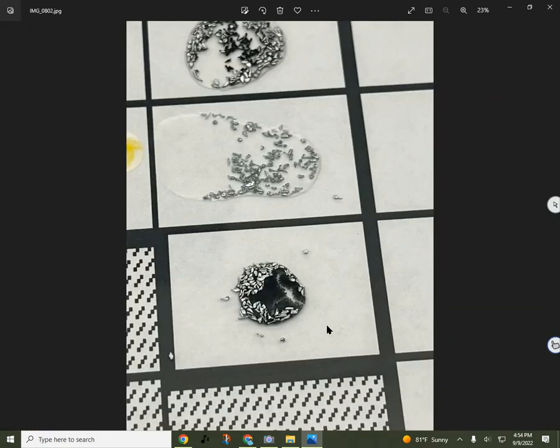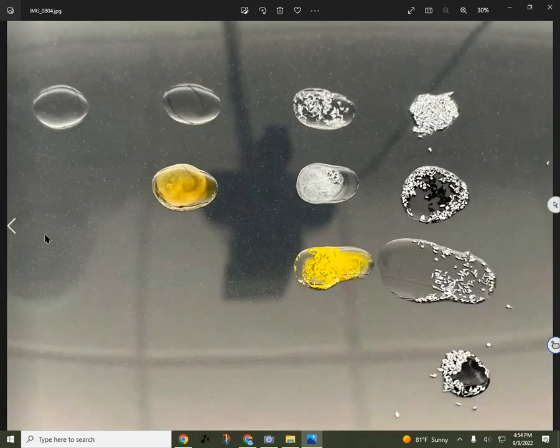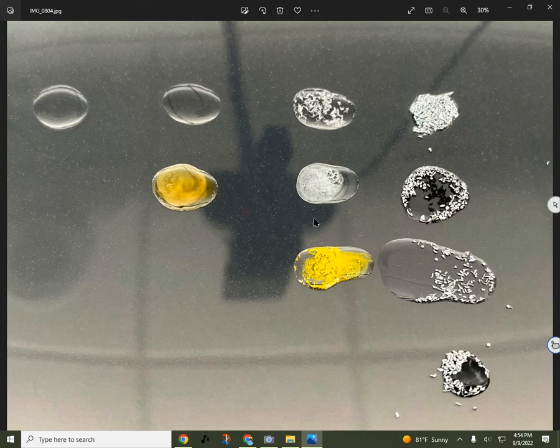Also the ones that have sunken have turned black, but it's actually looking kind of fuzzy. I got a little closer with this one — you can really see that there is something growing out of the zinc that has sunk in. These are crystals forming, so there's definitely some chemical reaction happening here. You can see it turned black here too, but it didn't grow as many crystals. With the black background you can really see that these two have some white precipitates that formed — larger crystals here and much smaller ones there.